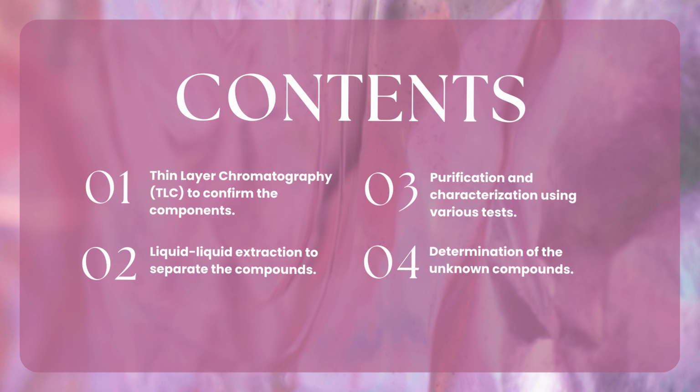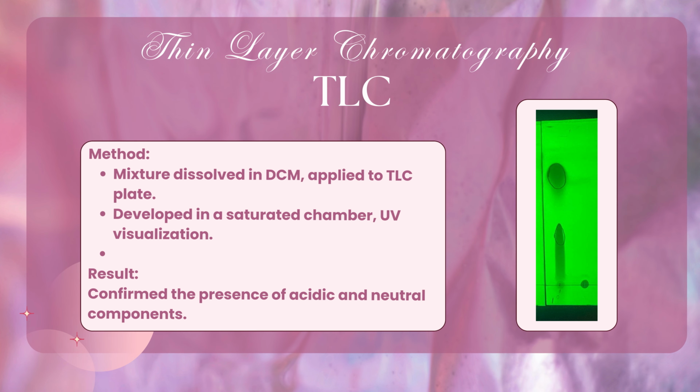So the first one is thin layer chromatography. TLC was the first step that I took to confirm the separation of the two components. I applied the unknown mixture onto the TLC plate, developed it in a chamber that has a solvent system and then observed the plate under UV light. As we can see in the picture that I attached here, the result showed two distinct spots, indicating that the mixture indeed consisted of two separate compounds.